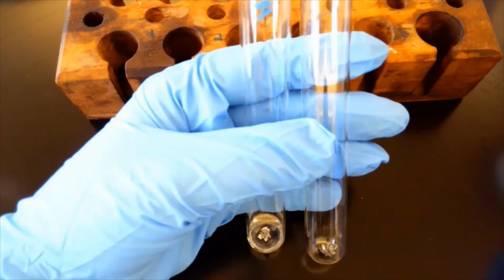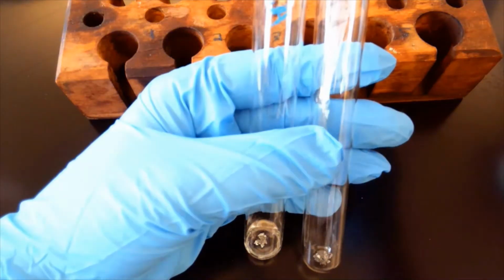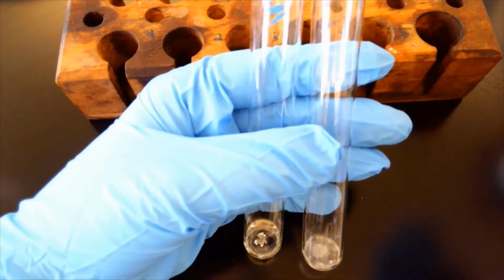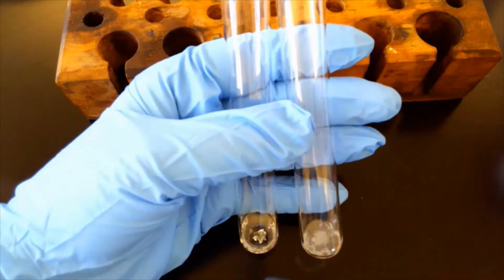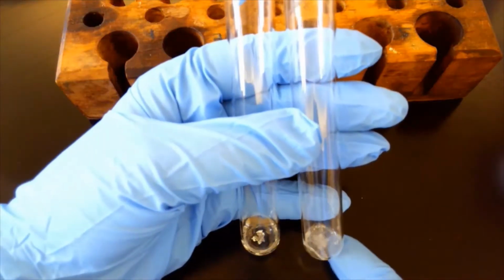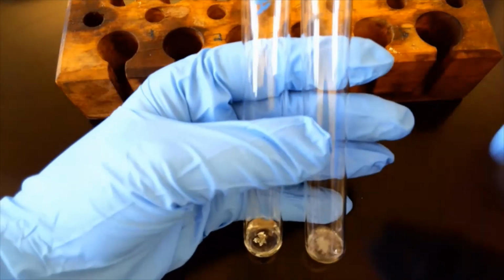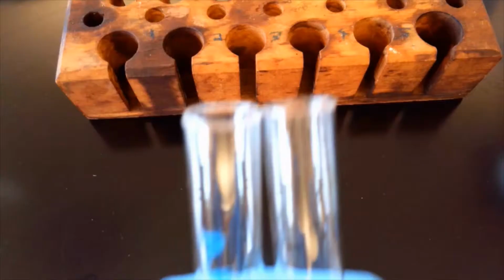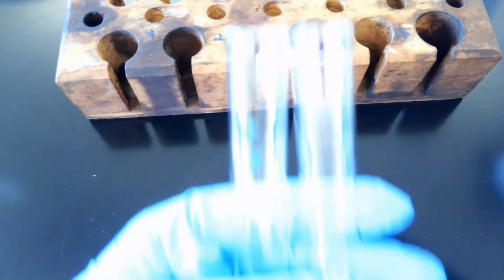If we add the 6 molar HCl into this one, vigorous bubbling. You can actually see the gas coming off that's forming. And right now this test tube is getting actually pretty hot. So we have a little bit of a heat change here, not a lot, and this is getting a little warmer. So as they react, they're getting warmer. The HCl is bubbling vigorously, and you can actually see some of the gas escaping. There it is from the end of the test tube. Isn't that nuts? So there it goes.